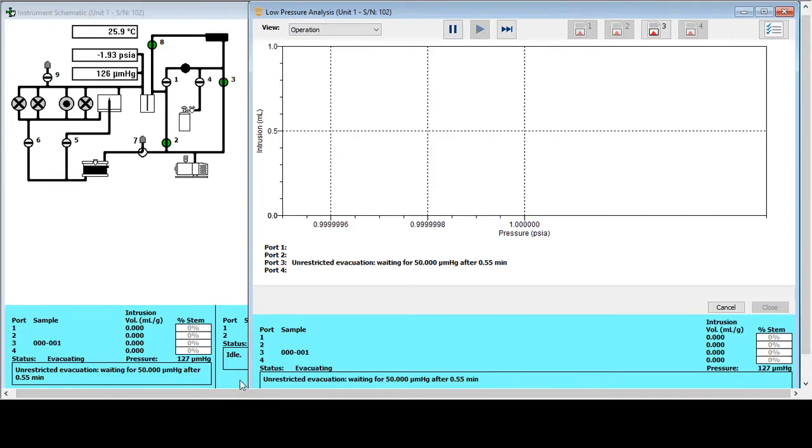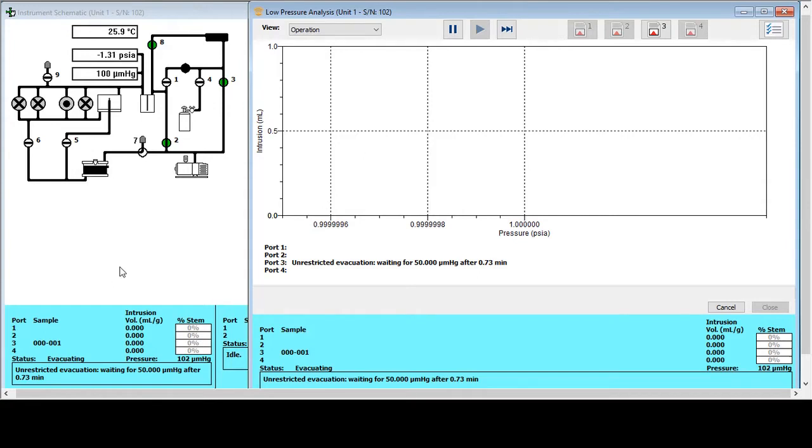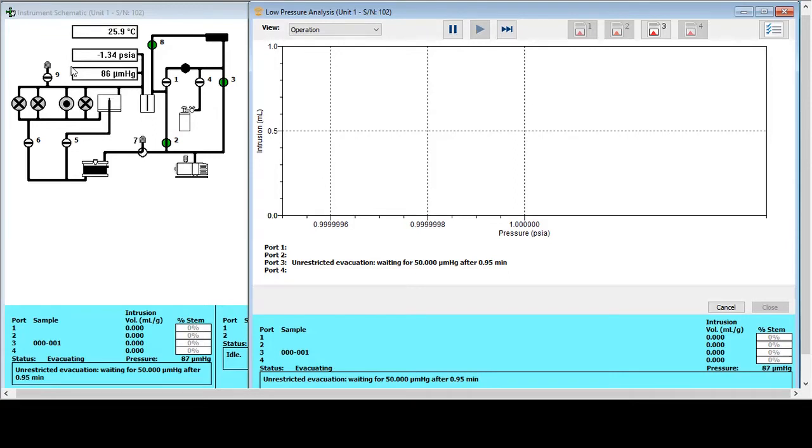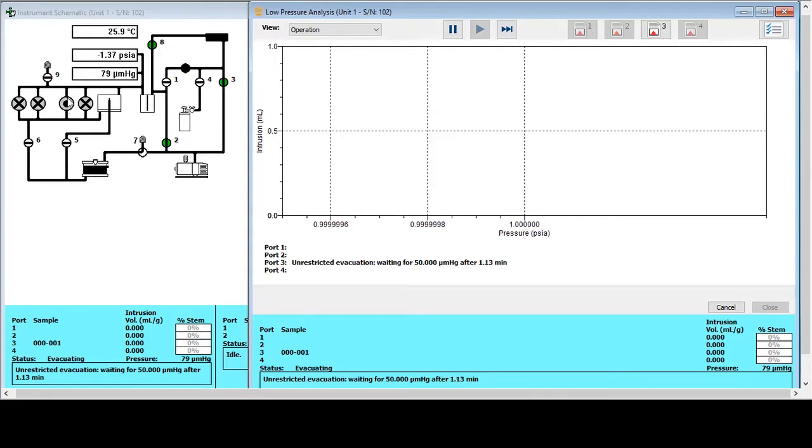Going over to the instrument software, we've already started analysis and the first stage is well underway. We've got two panels open here, but we're going to concentrate on this one over on the left hand side. This shows the instrument schematic and it's just showing the low pressure side at the moment. And the important features here are the pressure transducers around here. We're working off the bottom one at the moment, the lower range one, and the sample ports, which are these four here. Now our sample is loaded into this port here, port number three, and that's shown by the black dot.